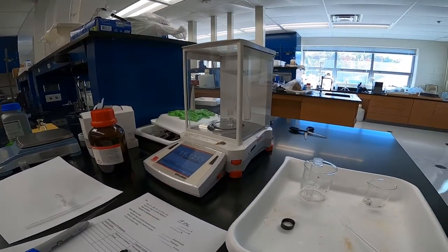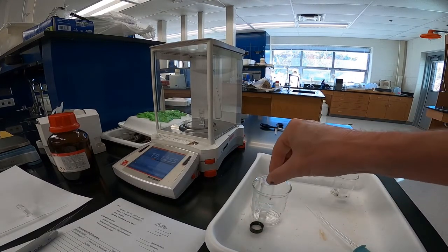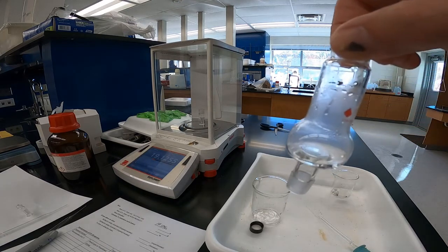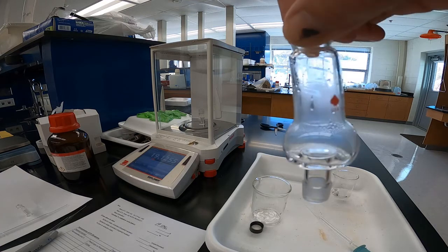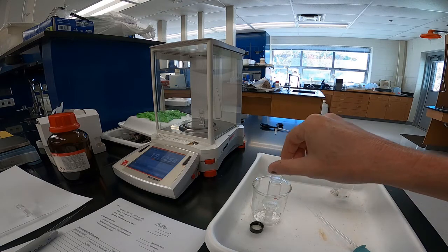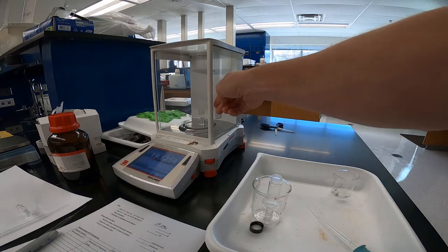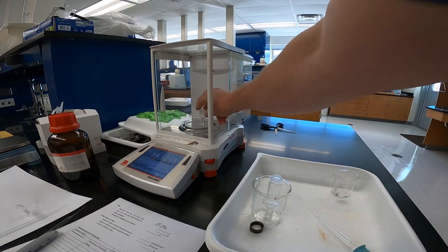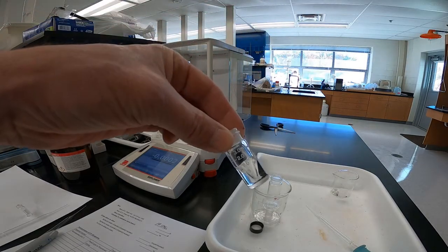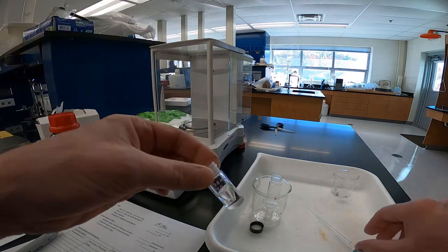All right, we're back now at the balance area. We have our product in just the Hickman distillation head. So again, if you look carefully at that, you can see the little bit of liquid in the bottom of that lip. And that's what we're going to collect with the glass pipette. So we're going to collect it into a small conical vial. So I pre-massed the vial. I'll give you that information in a minute. And these have little increments on them, which helps us with the process.